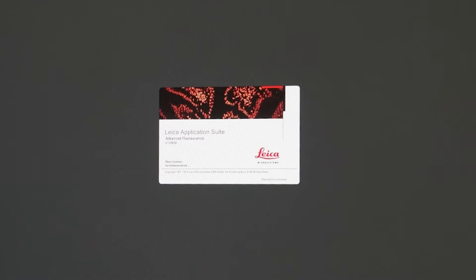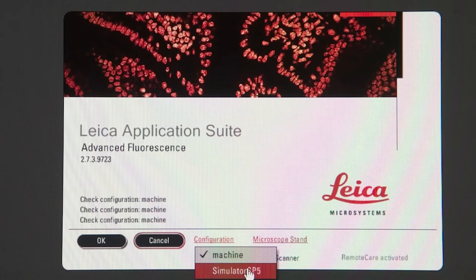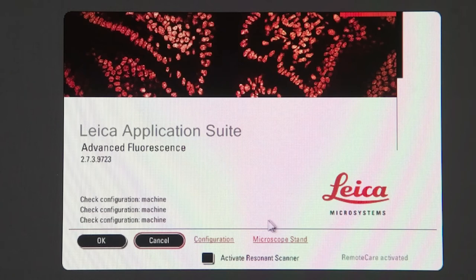There's going to be a few pause points while you start up the software and you'll need to check a few things during this process. The first screen that comes up has three things you'll need to check. The system starts up with the initial settings that it last ended with, and it's possible the last person was doing something different than you're going to want to do. First, check under the configuration tab. You want to make sure it's set for machine. If the last person used simulator, that would be selected instead. To the right, make sure the microscope stand is set to DMI 6000. If it's set to manual it won't connect to any hardware when we start up.